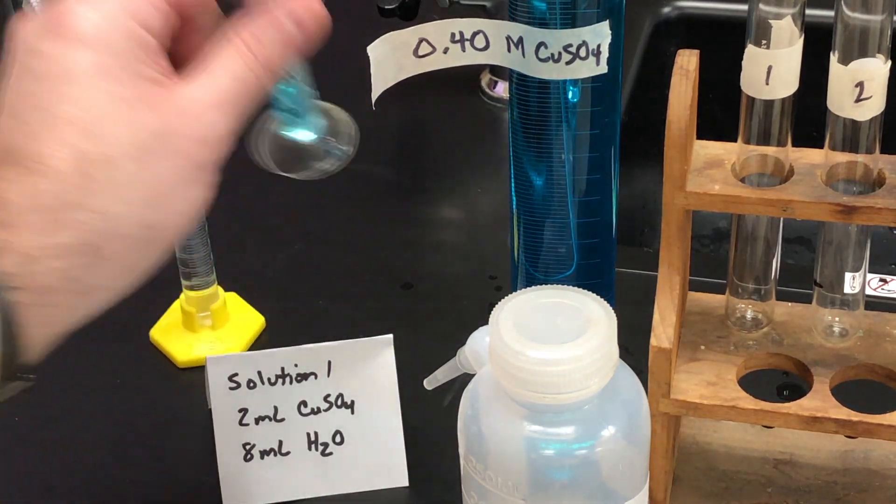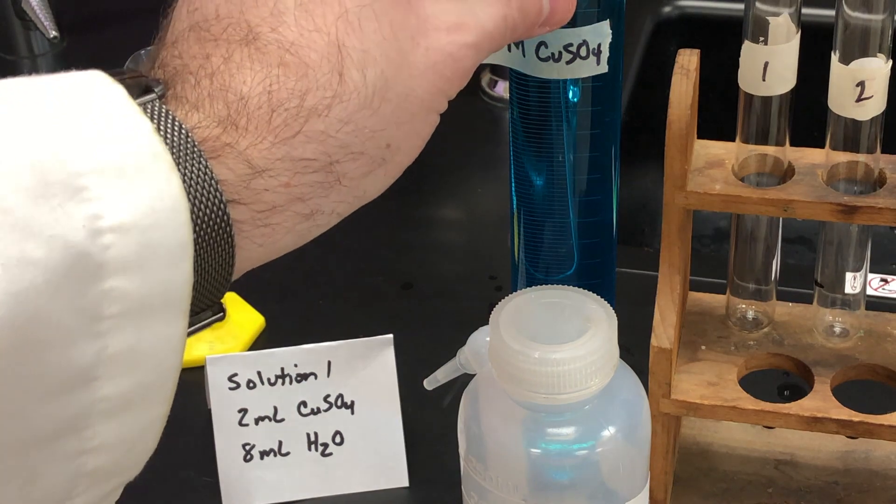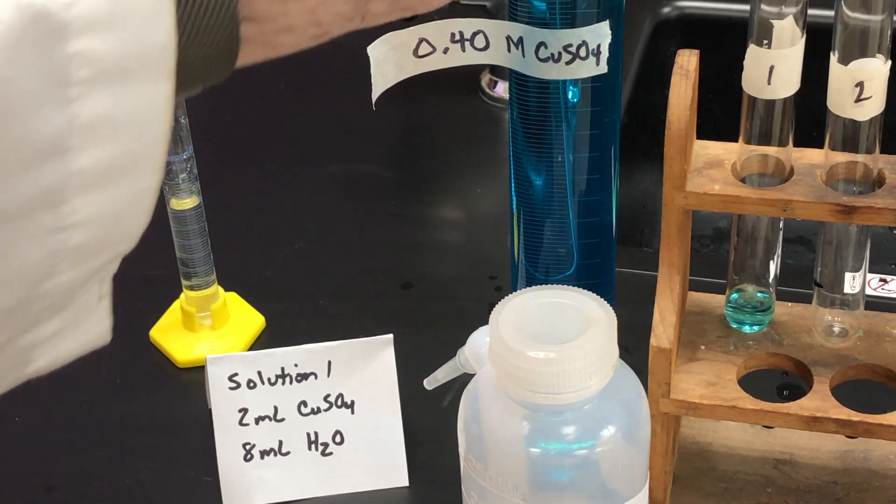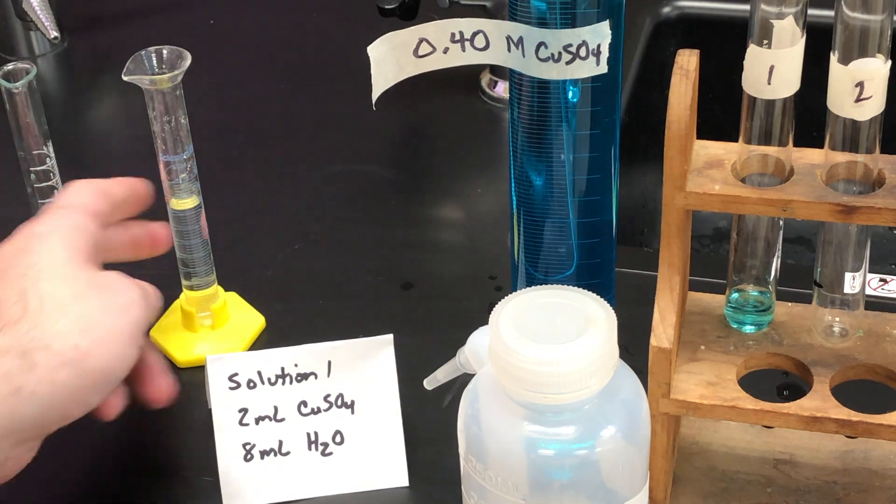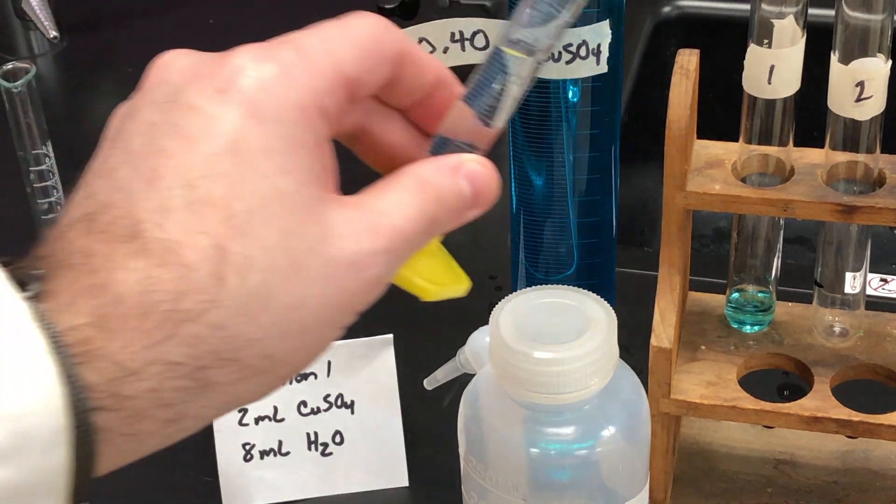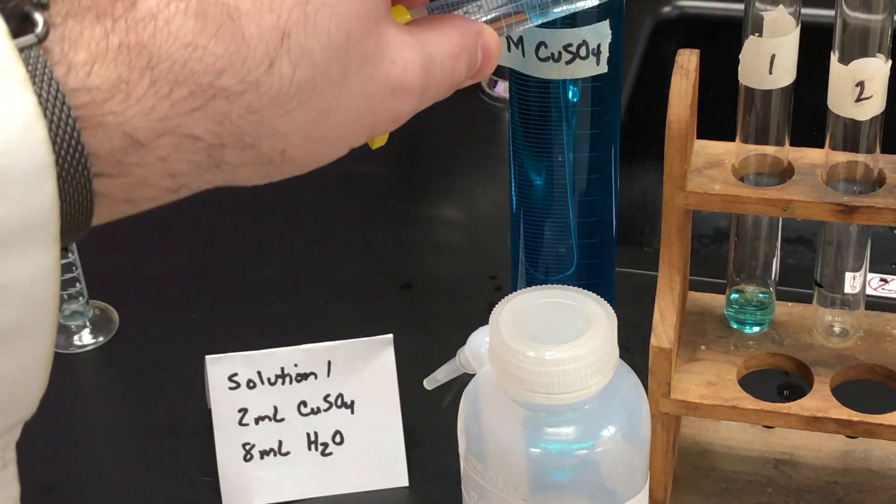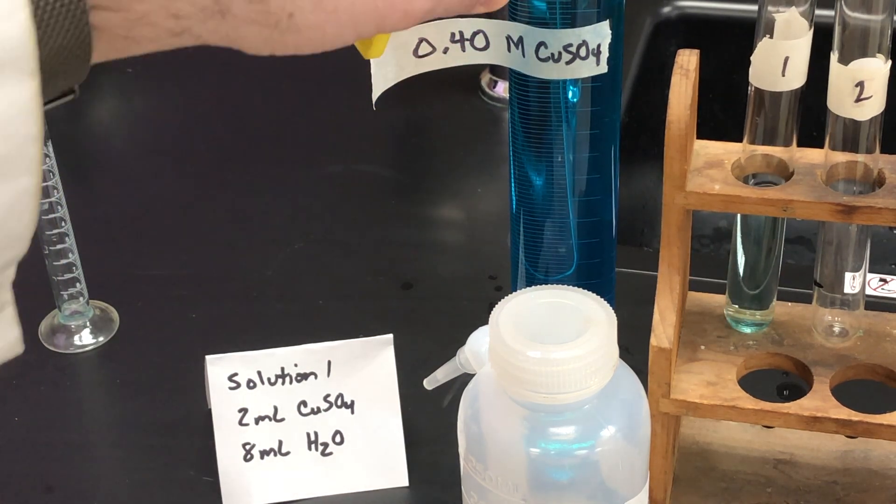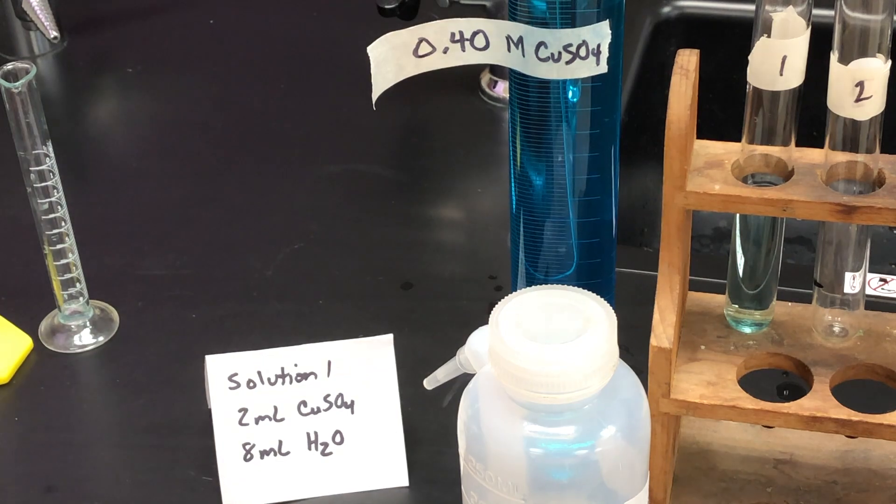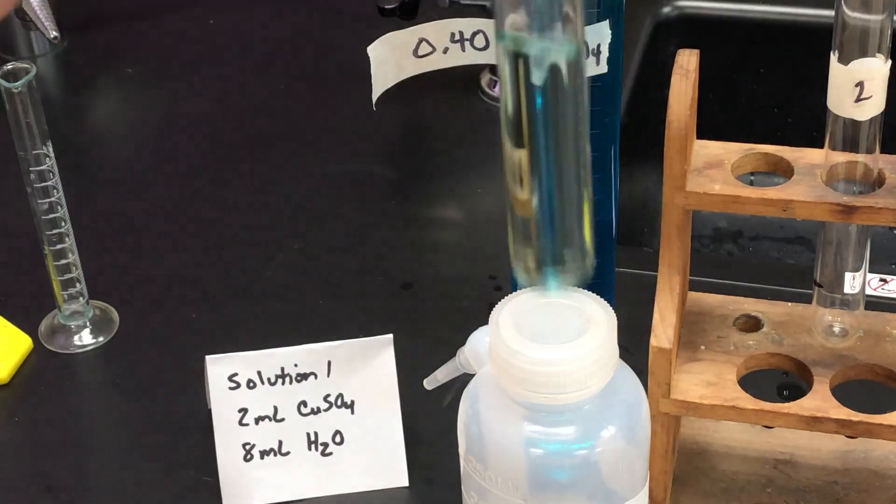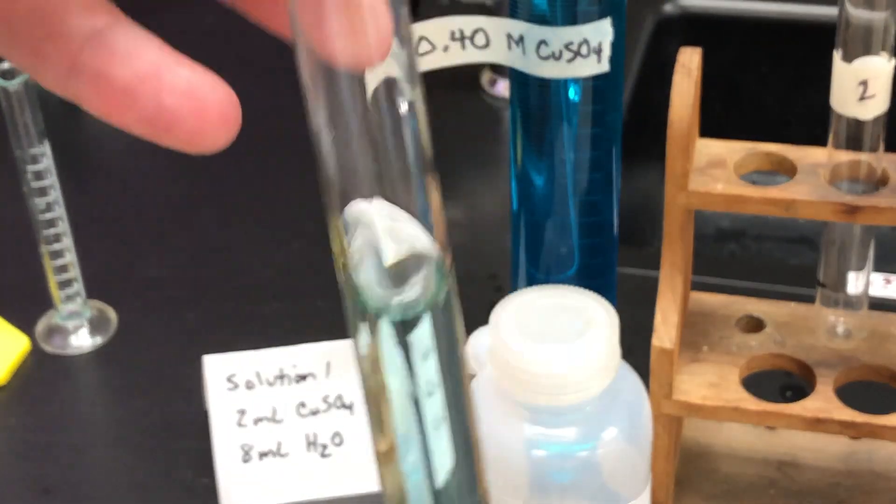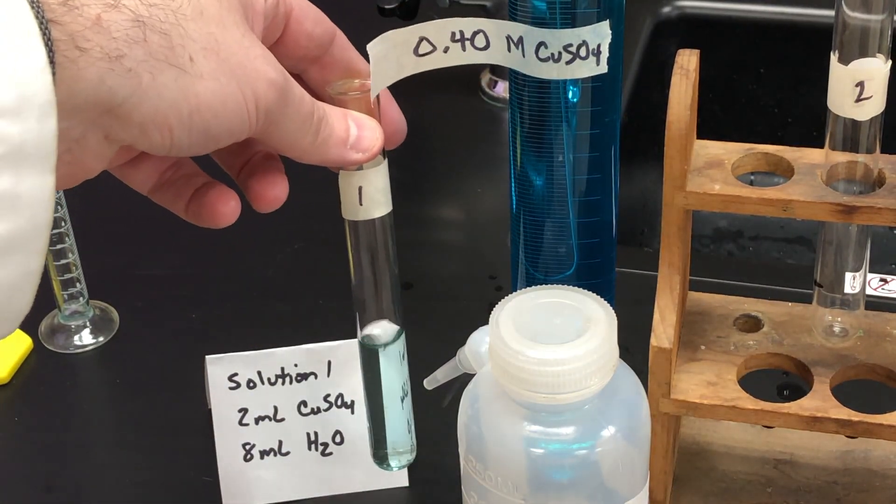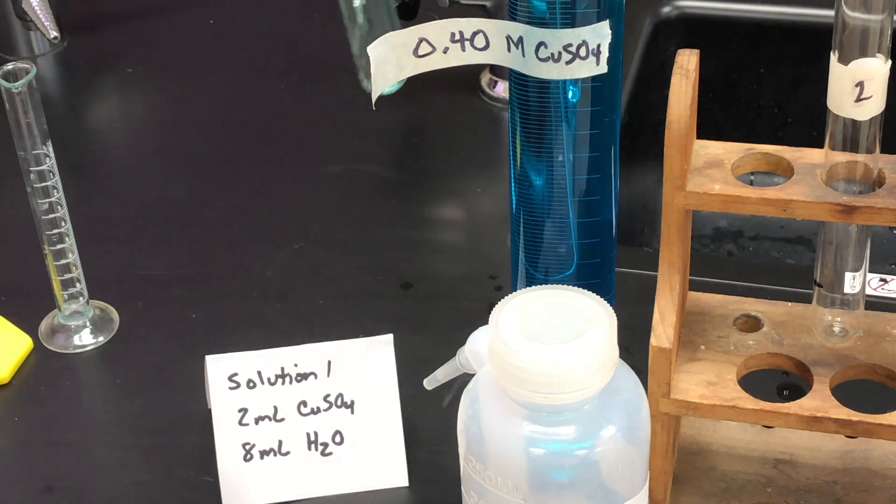So what's going to happen is we'll mix these together and let it sit so they can mix properly. So what you do first is add the copper sulfate, pour it in, and then add the water. Pour it in, and then give it a little shake, and there you have it. This is test tube one, and I want you to notice how pale the blue is compared to the starting solution.